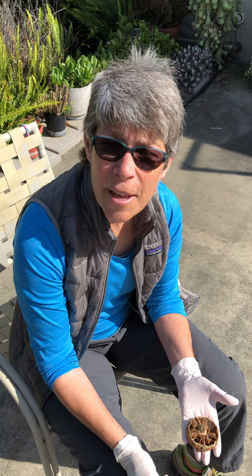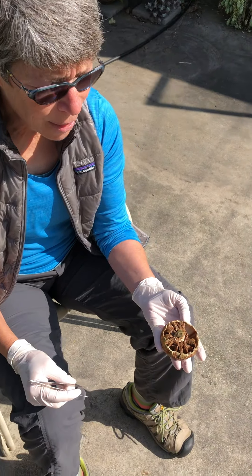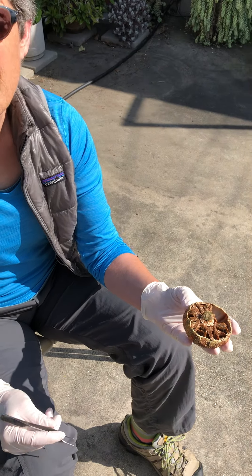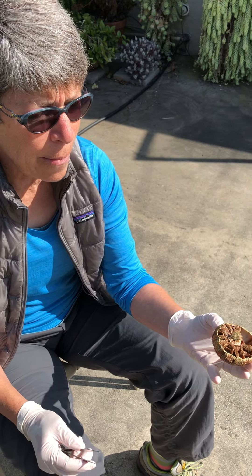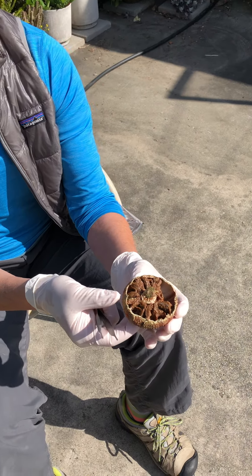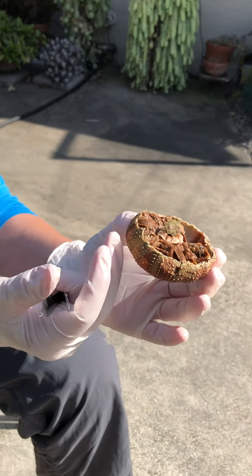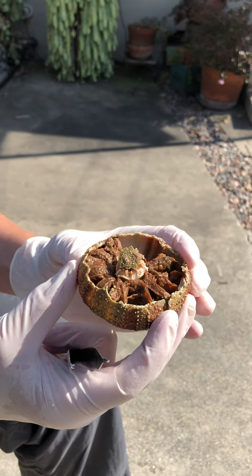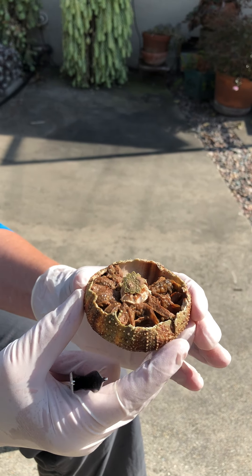For the internal anatomy of the sea urchin, the first thing we need to do is get oriented because the sea urchin looks a lot different than it did before. Most of the oral end is intact, but you can't see it. The part that you can see is the aboral end, and most of that has been removed.